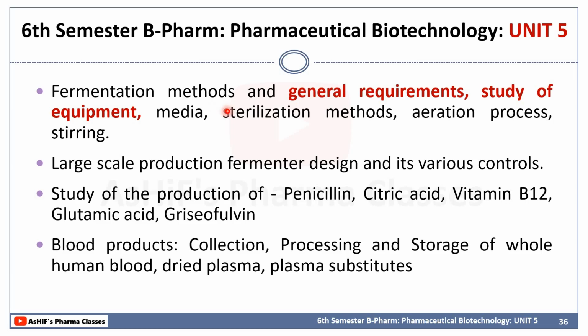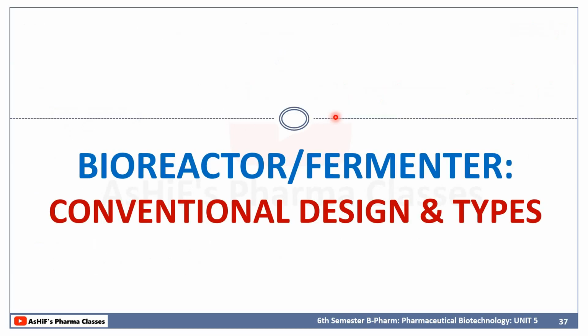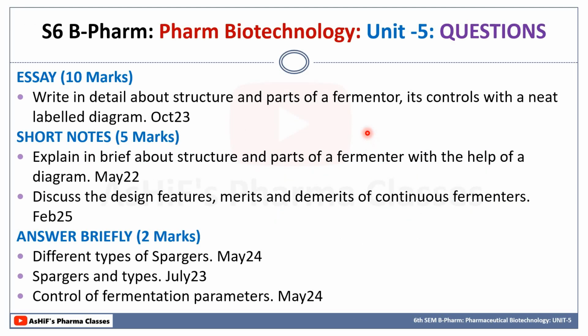The equipment which is used for the fermentation is known as fermenter. These are some of the questions from this area. This is a very important topic for your examination. You can see, as an essay, write in detail about the structure and parts of fermenter, its control with the neat labeled diagram. So diagram is very important here.